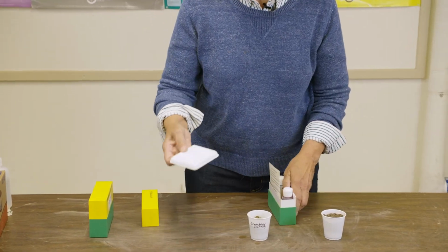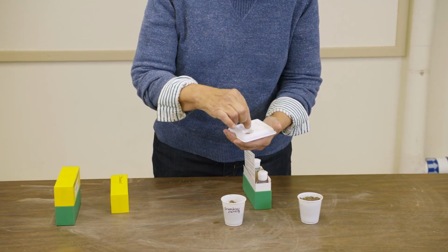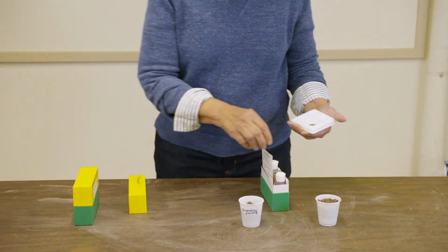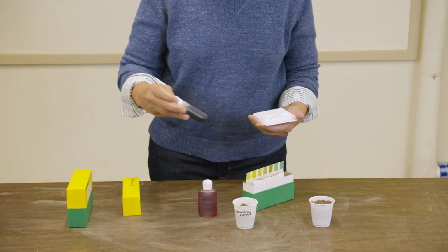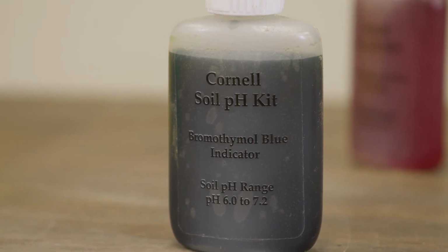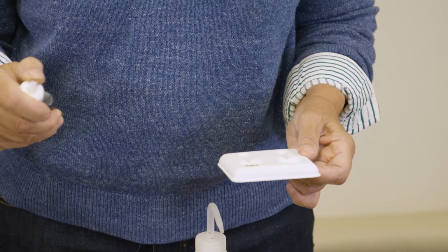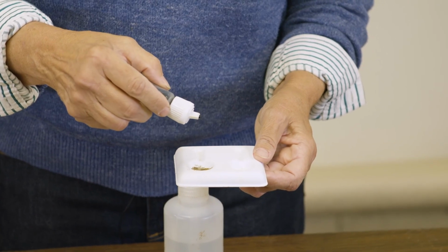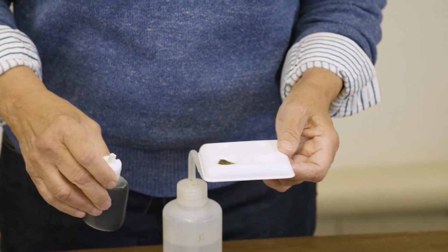So we have these cups where we're going to put a little bit of soil in one of the depressions. I'm not going to fill it up, just a little bit of soil. And then we're going to take one of the reagents here. There are two. We always start with bromthymol blue, which is the neutral range. We want to start with the neutral range, and then we can go up more alkaline or go down more acid. So using bromthymol blue, we're going to drop by drop, until we have a little bit of free solution.